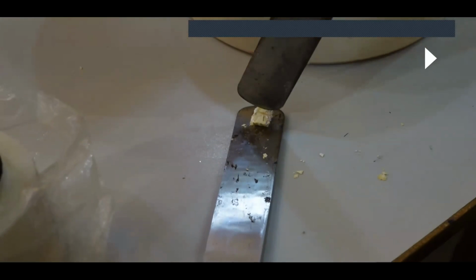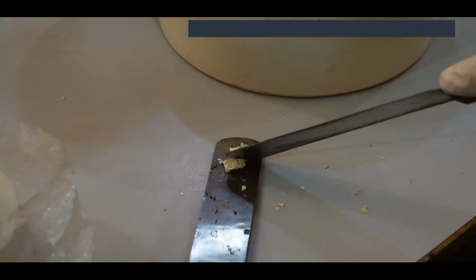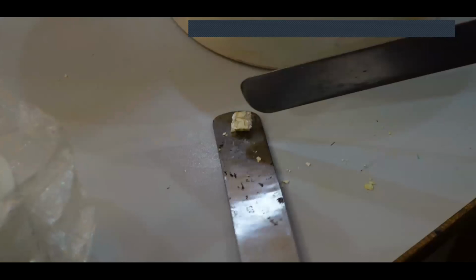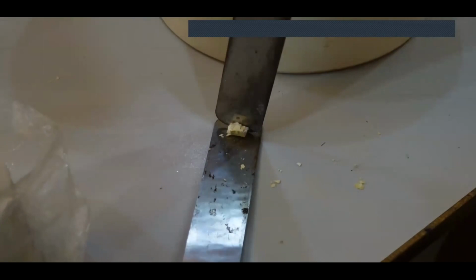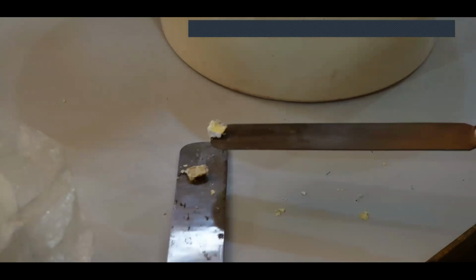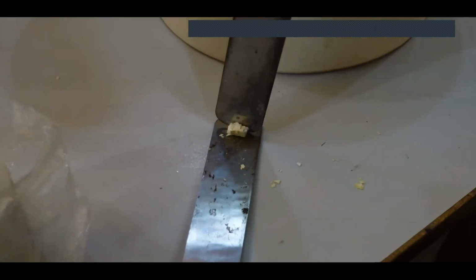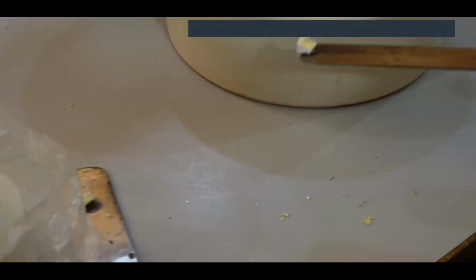So here's what I'm going to do. Just a small bit of force and notice that I've cut it, right? It is so soft. I was able to cut it just by a small force, as you can see over here. And do you see a change in color? Look at the fresh side that comes out. Do you notice something about it? There's one side that is yellow and one side that is grayish or silvery, right?